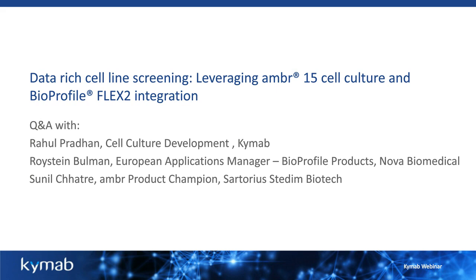I have a question regarding cell counting on the Nova FLEX2. Were you able to establish good comparability between the FLEX2 and the in-house cell counter? This would be any reference cell counter that you may have. Yeah, so before we did the integration of the two systems, we went through a whole process of comparing the data that was acquired from the ambr systems via the ESM module with the cell counter that we have in-house. And we also compared offline measurements which were done without the ESM on the FLEX2, and we reached, and Nova can help you with that process.